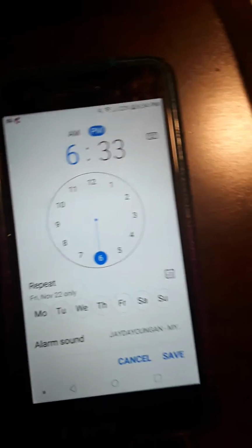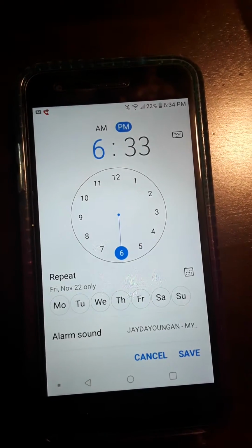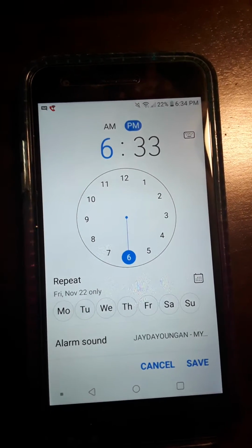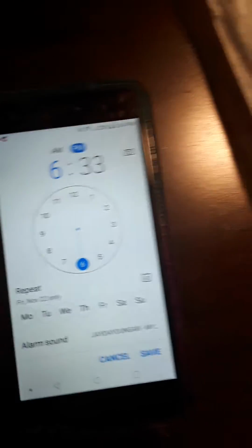So we have the time down at 6:33 p.m. The date is November 22nd. Okay, move it over my plate.